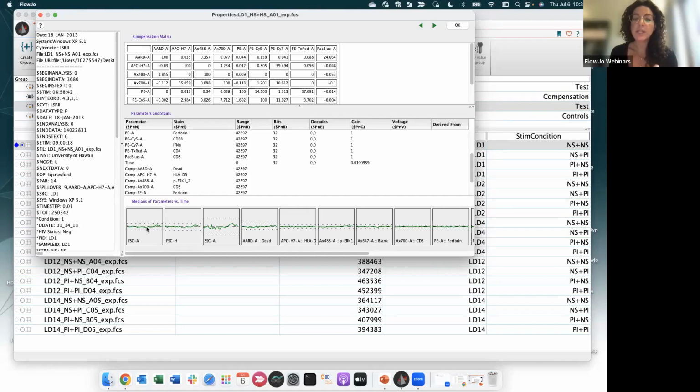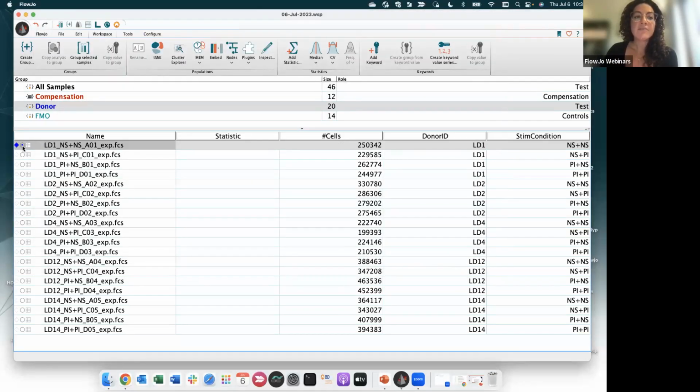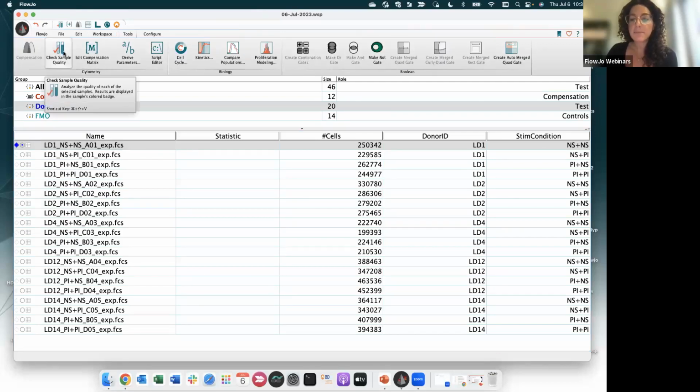We do have a really nice webinar on quality check from my colleague Veronica that I also invite you to watch if you want to go deeper into all the tools that we have for quality check. But for the basics and for an initial step, this can help you. So now I have my blue badge saying that the quality of my file was okay because the median value of each parameter was included in the two standard deviations. And I could go one by one, or I can just go under Tools and click on Check Sample Quality. This will automatically check the quality of all of my samples.